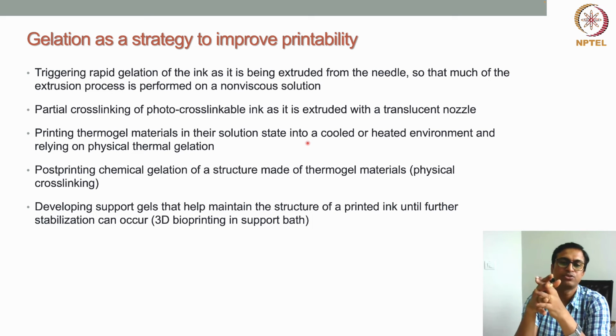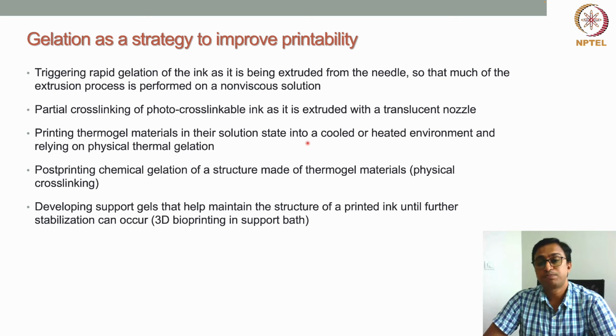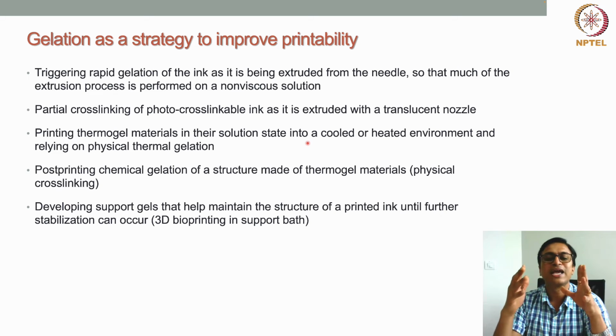That can help to retain the shape of the structure, prevent collapsing or spreading of the structure, and print fidelity would be very good, right?